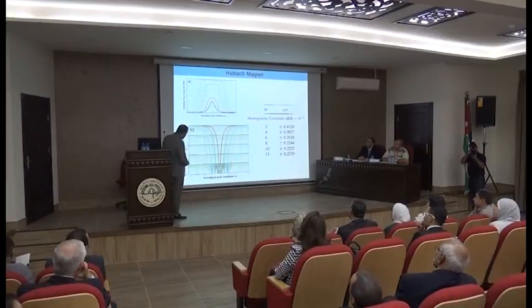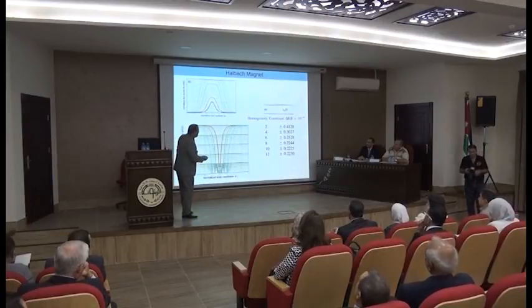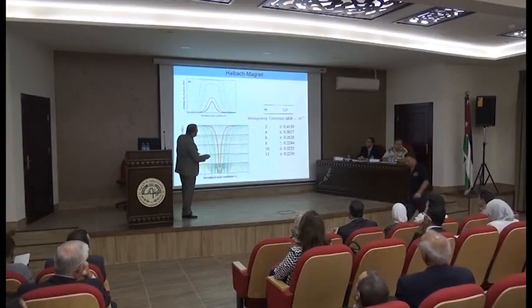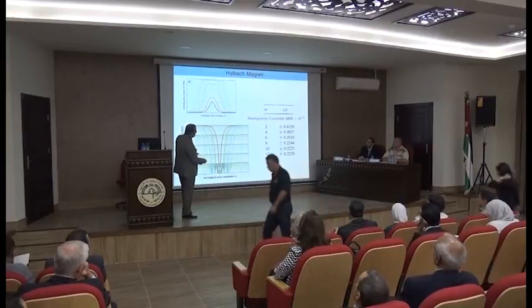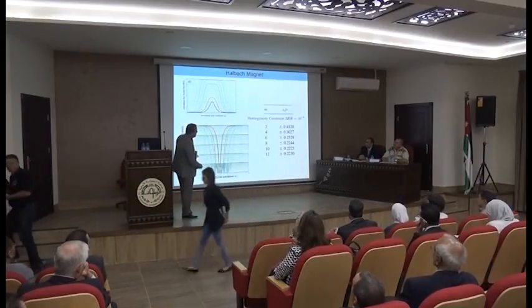And this is the homogeneity of it. It's here, this line, and it's NMR accepted. Not perfect till now, but to say it's possible. And you see here the improvement of the homogeneity. After 12 it's almost like 10, and so we decided to take 12 because of the experiment.